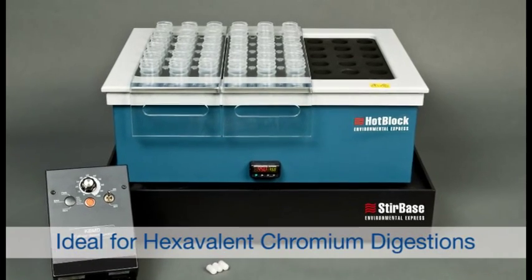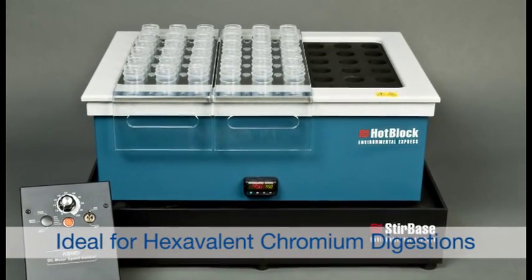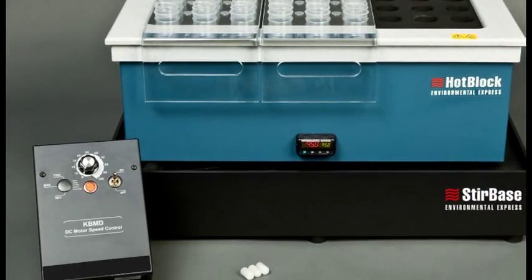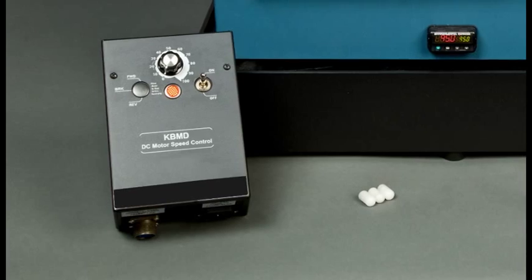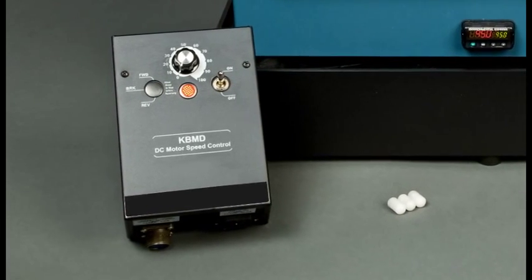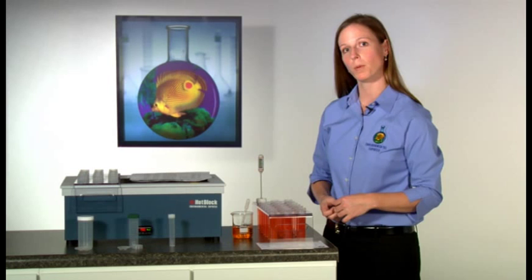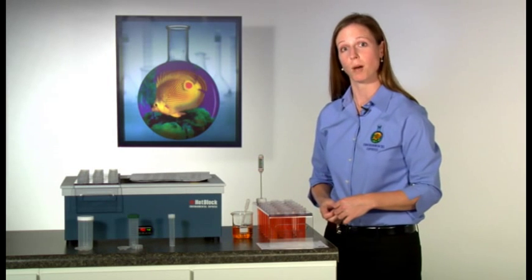The Environmental Express stir base also utilizes hot block technology while allowing constant stirring of your samples. The mixing speed is easily adjusted using the accompanying controller with a six-foot cable, eliminating the need to be inside the hood during digestions.